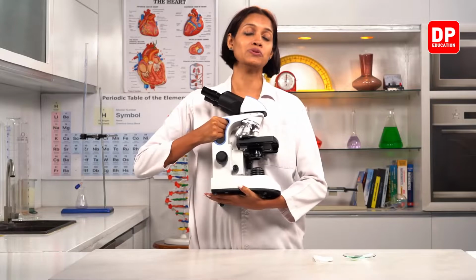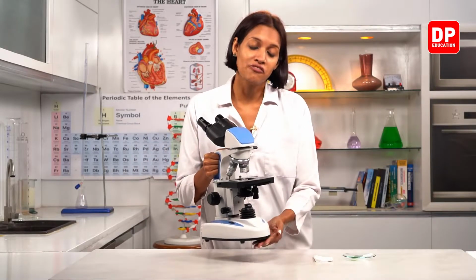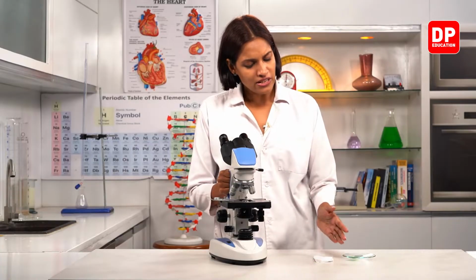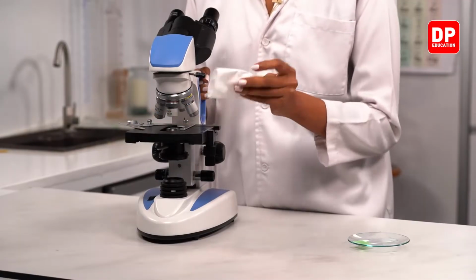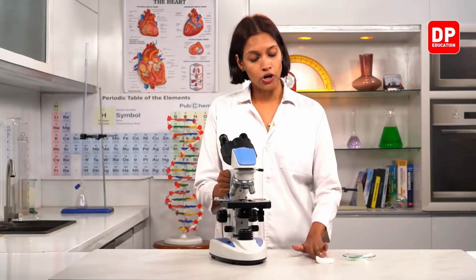And then when you go to another place, you have to place it on another flat surface very carefully. Right, children? That is the first thing. And even earlier I mentioned this one. After using the microscope, we always have to wipe the stage with a clean piece of tissue or a cloth or even a clean piece of cotton.